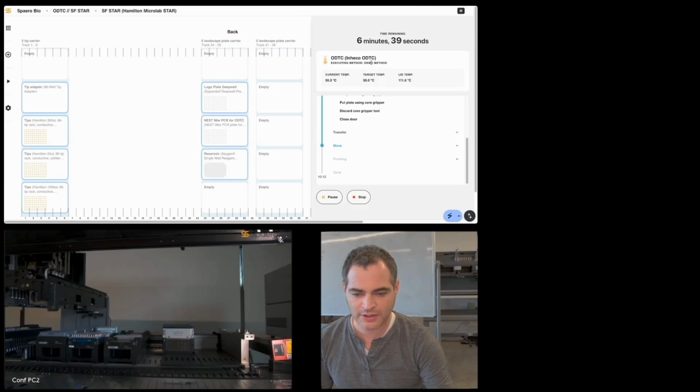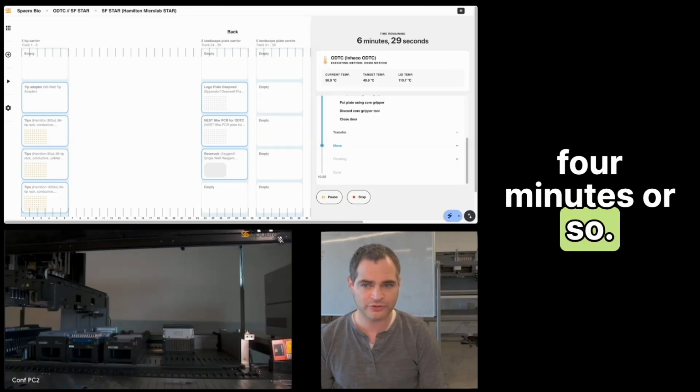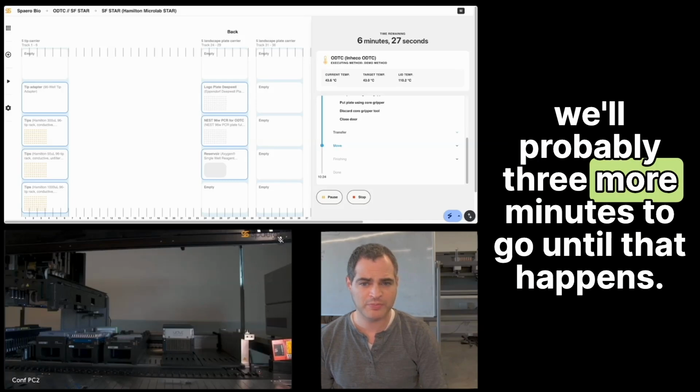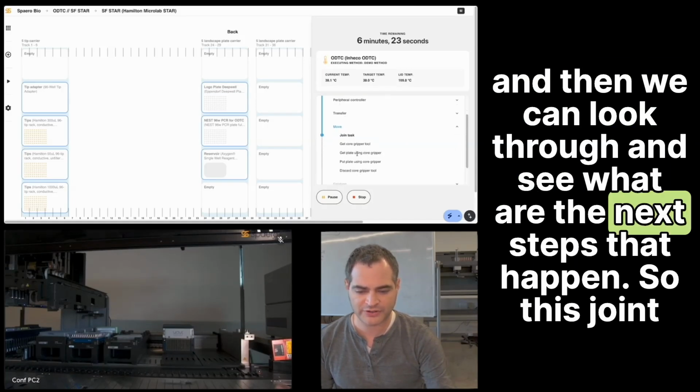So now the protocol is executing. That'll take, I believe we said 260 seconds. That's 4 minutes or so. We'll probably have 3 more minutes to go until that happens. And then we can look through and see what are the next steps that happen.